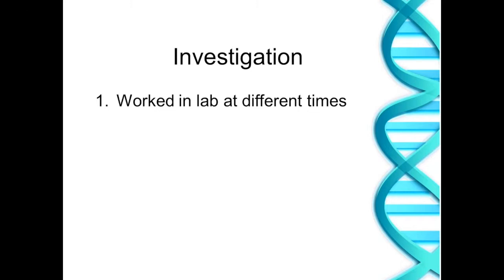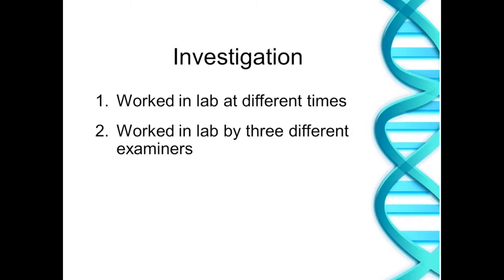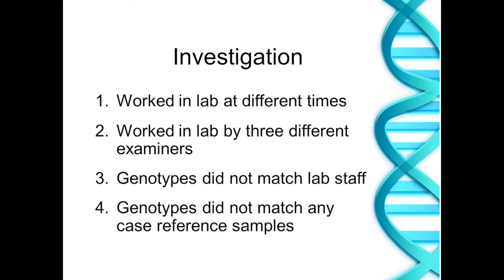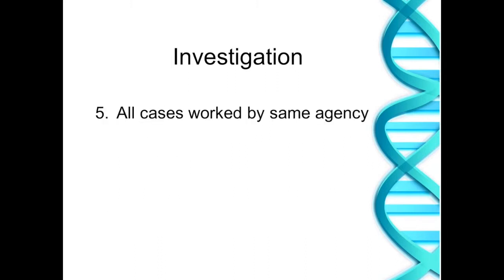So the first thing we could say is, number one, these were worked in the lab at different times by 3 different people. The genotypes don't match the lab staff, anybody that works here, and they don't match any other case reference samples in our database. So that started pointing us in a different direction.